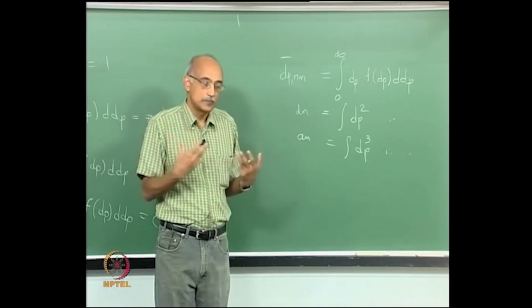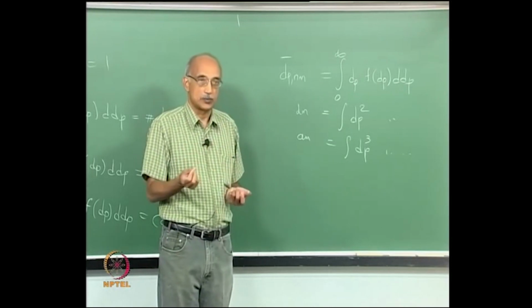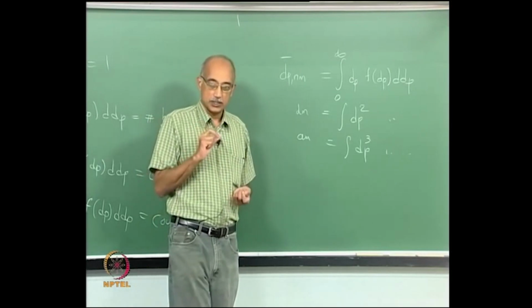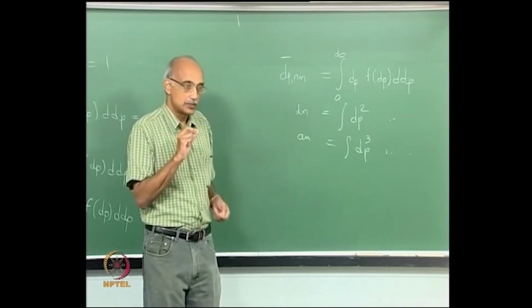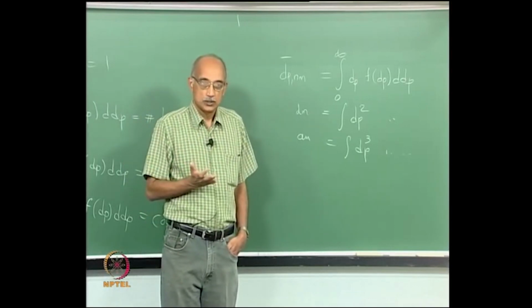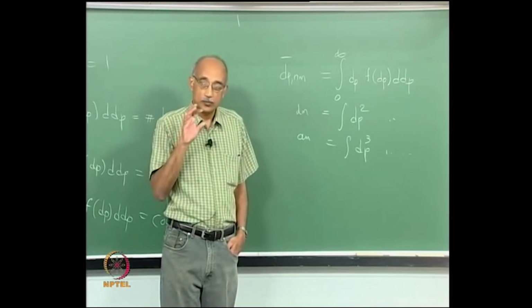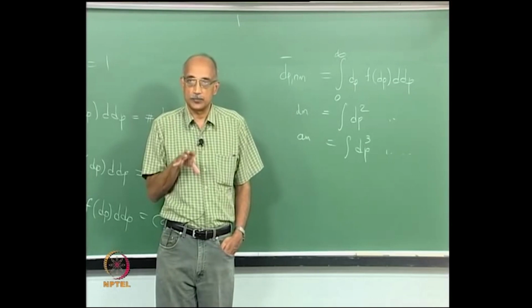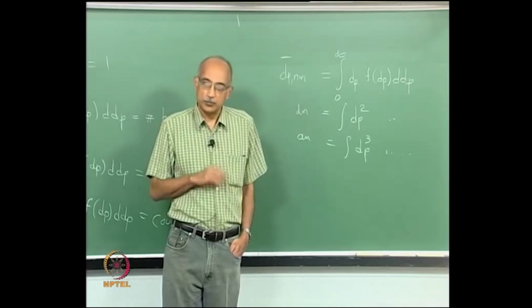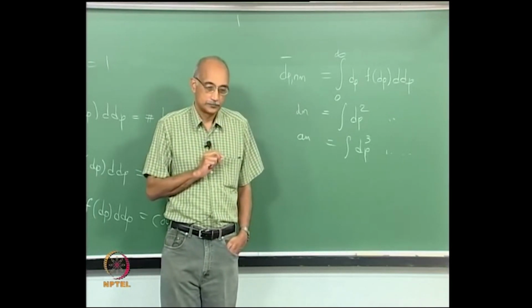This will enable you to also understand the mechanisms of formation of these particles, because as we discussed in the last class, each characteristic size distribution has a specific source or combination of sources associated with it. So the particle size distribution curve will actually provide you a lot of information, not only about the counts and sizes of the particles that are present, but also the history of how these particles came to be. So it's very powerful data, but it must be carefully analyzed and managed.